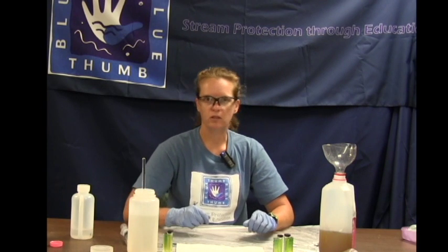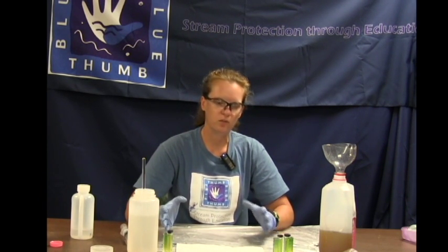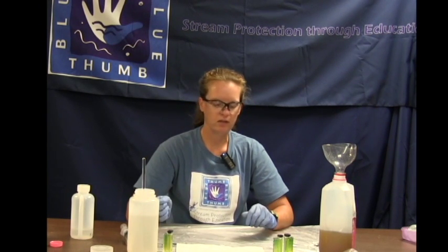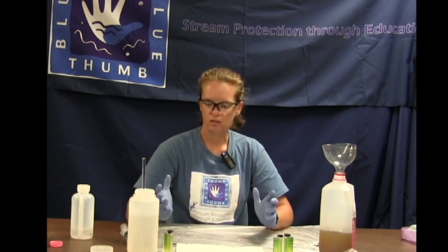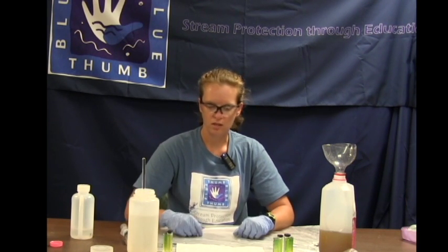Usually whenever I'm doing my creek water tests, this ammonia test is the first thing I start with because it takes 15 minutes to develop. So I usually get all 3 of my cubes started and then set them off to the side and write down the time that they're due, and then get started on like the dissolved oxygen test or pH test or something like that as the 15 minutes are developing for the ammonia test.